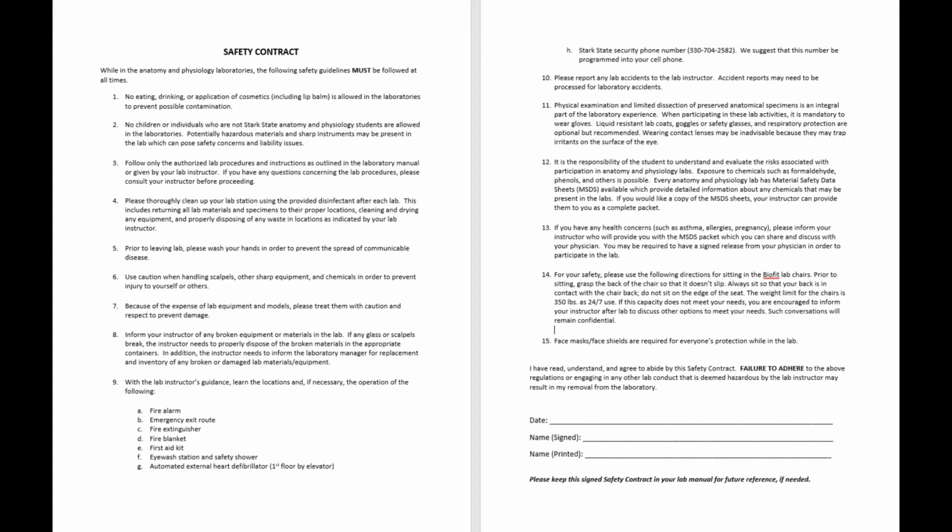13. If you have any concerns, such as asthma, allergies, or pregnancy, please inform your instructor who will provide you with the MSDS packet, which you can share and discuss with your physician.